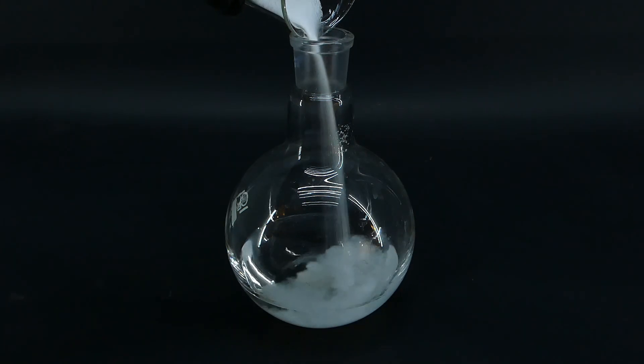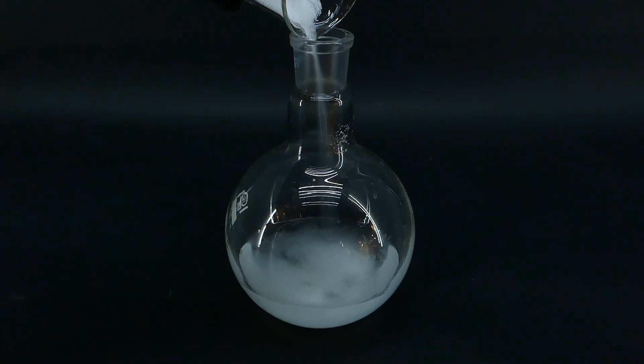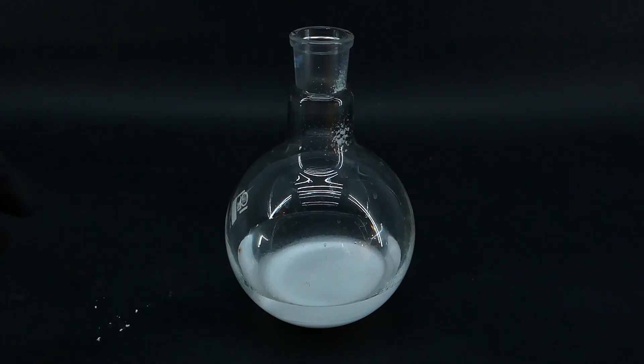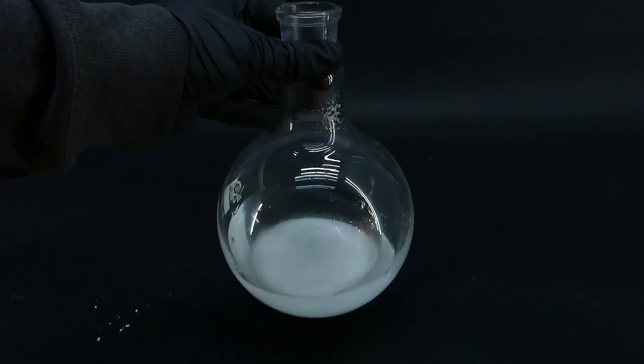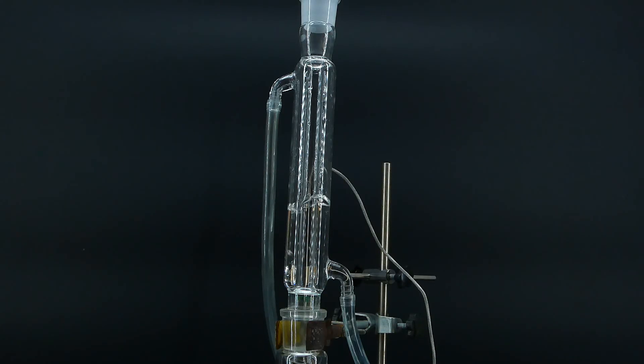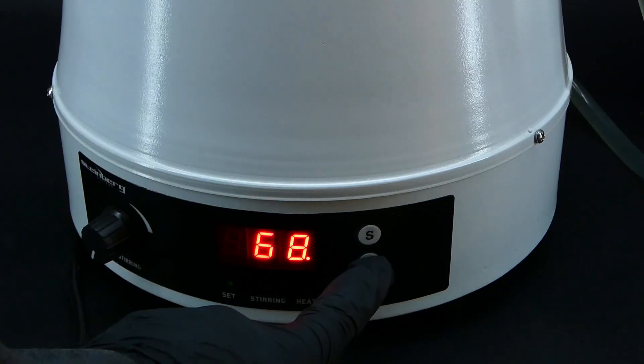After the addition of sulfuric acid, I poured in 62g of boric acid into the flask. After all of the boric acid has been added, I placed the flask in a heating mantle, put a condenser on top of it, and started heating the mixture.